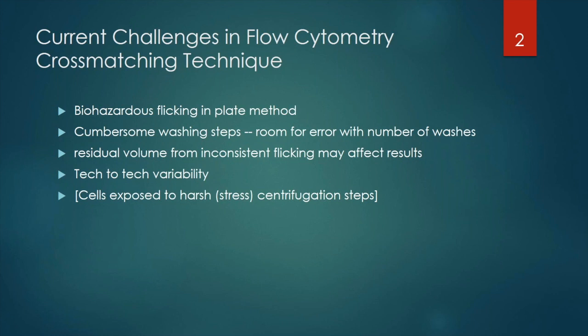Biohazardous flicking in the plate method. If you're using a tube method for tagging, you may not be at health risk, but those that use the plate method for tagging and flick their plates to remove supernatant get exposed to aerosols. Technologists should use face masks while flicking their plates into biohazardous containers or into the sinks.